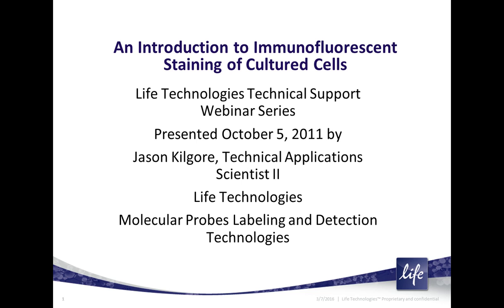My name is Jason Kilgore. I'm a technical application scientist in the tech support department here at Molecular Probes, which is part of Invitrogen and Life Technologies. Today in my presentation I'm going to be talking about a basic introduction to immunofluorescence staining of cultured cells and tissues.